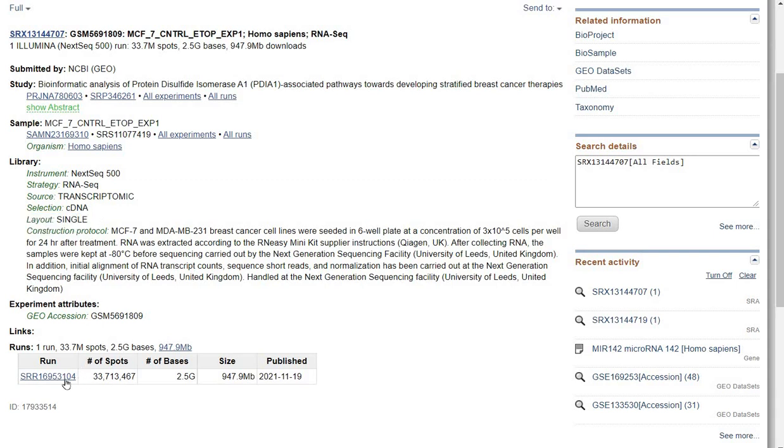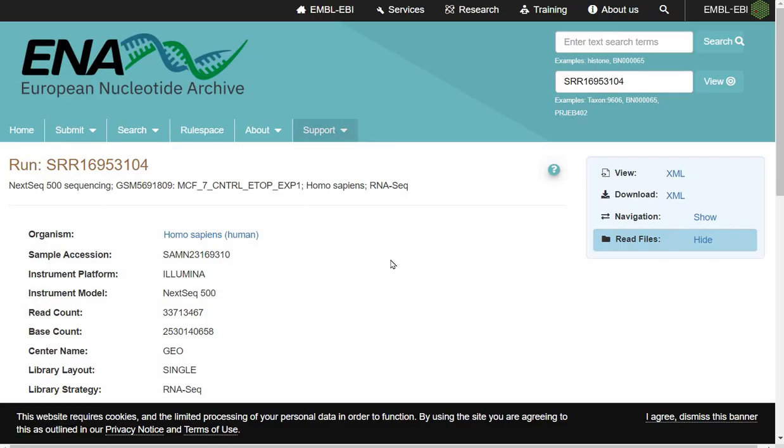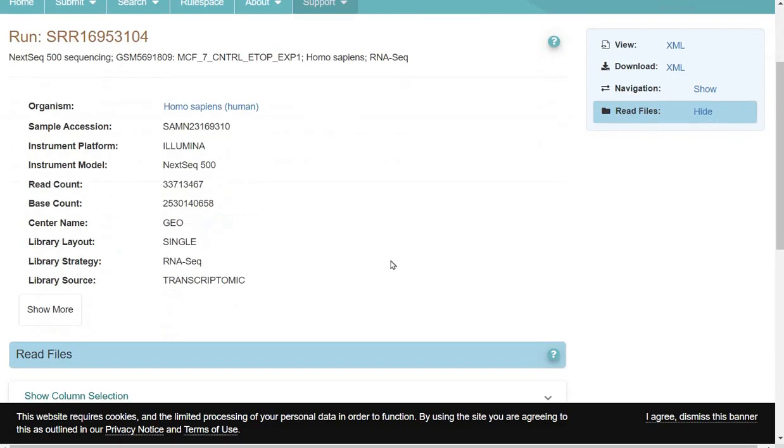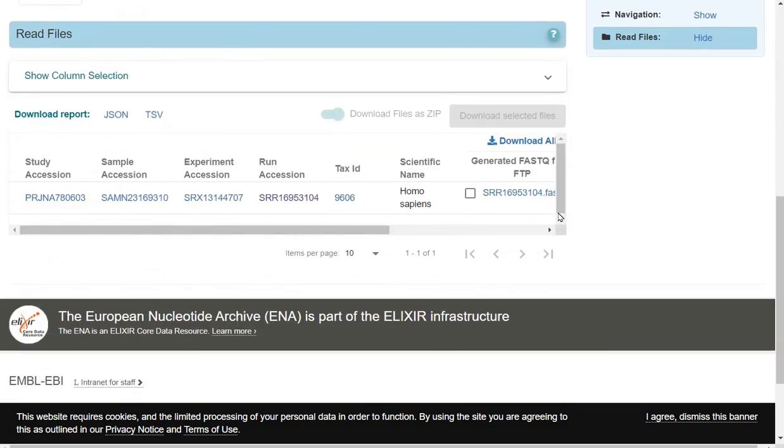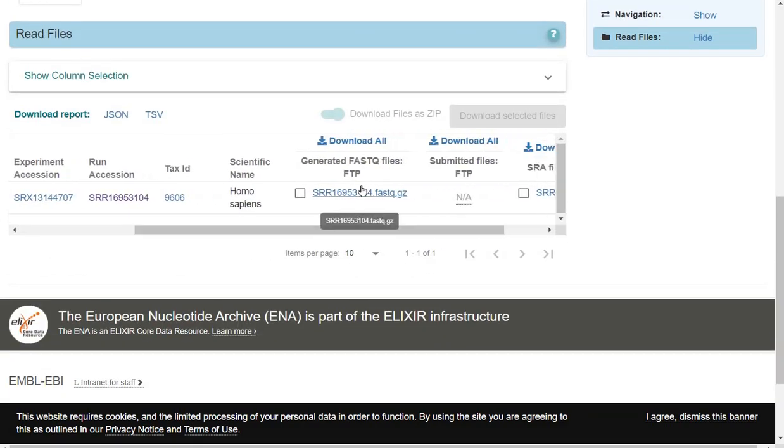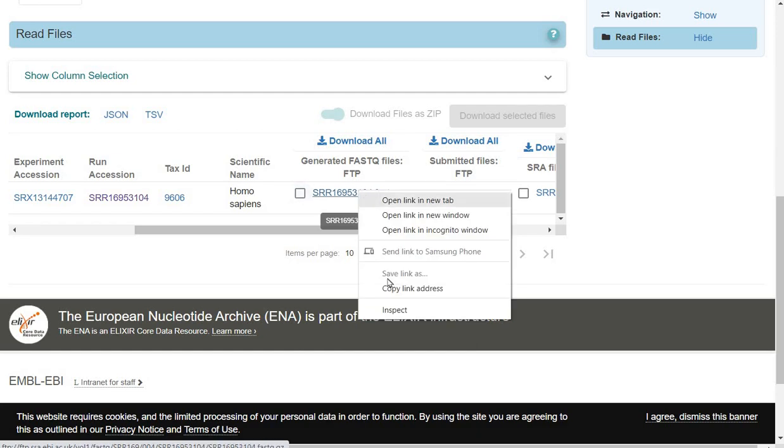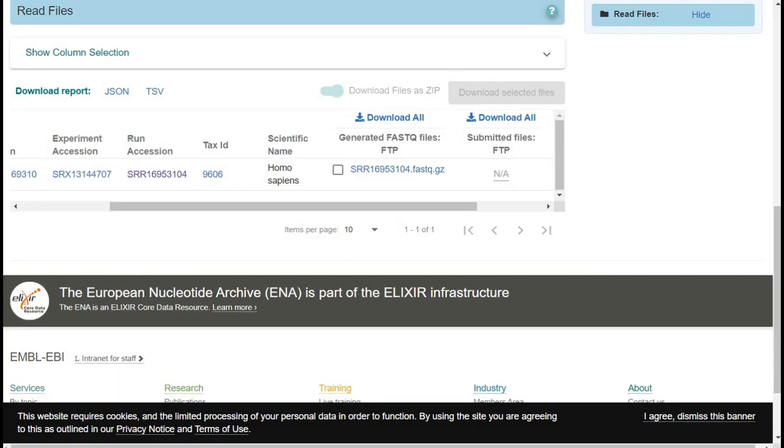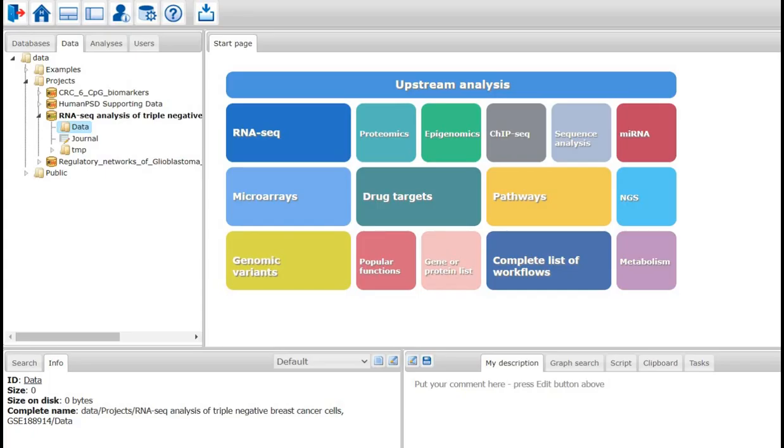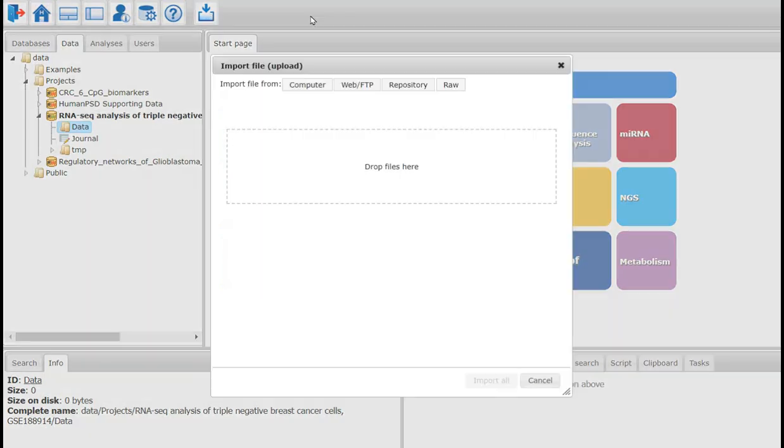I copy the SRA run ID and paste it in the EBI browser. The EBI browser opens the page with the detailed information about the sample, and also the link to the FASTAQ file is available here. I right click on this link and copy the link. Now I go back to the GeneXplain platform and press the import button.